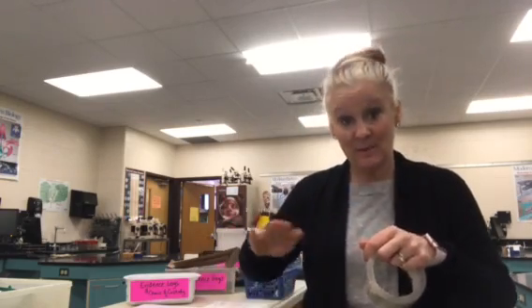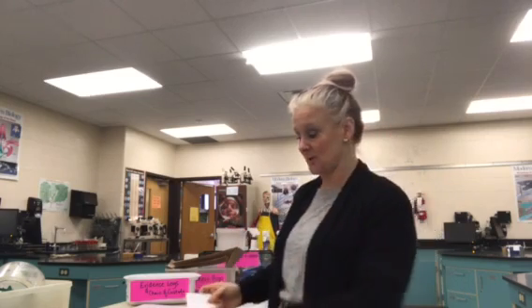So all you have to do is take the piece of tape, cut it off, put it down on the carpet, rub it like we did when we did our clothing, put it on the spot paper. Once you've got that lift, then you're going to create a bindle. So let's say I've got my lift. I've gone to the student center. I'm in charge of the student center. Now I have to make a bindle.